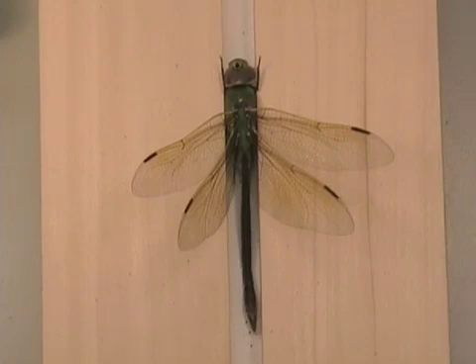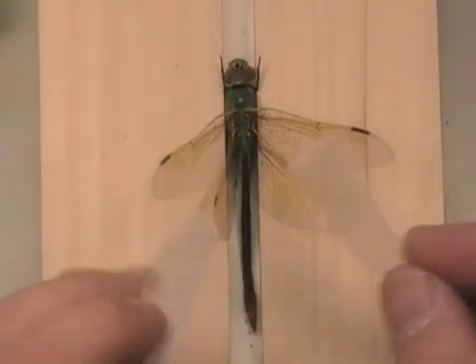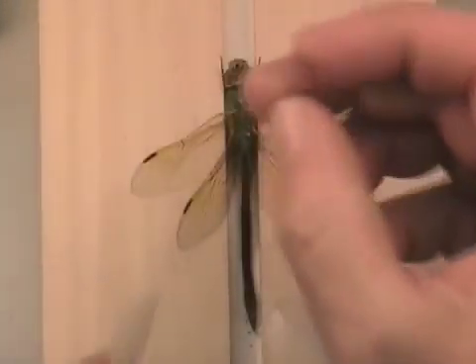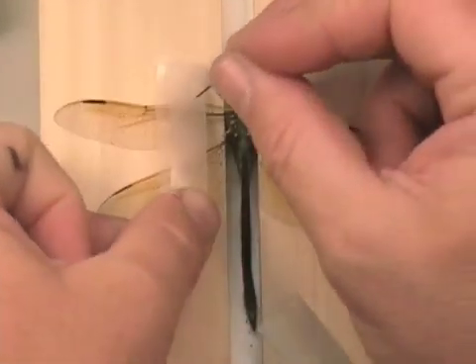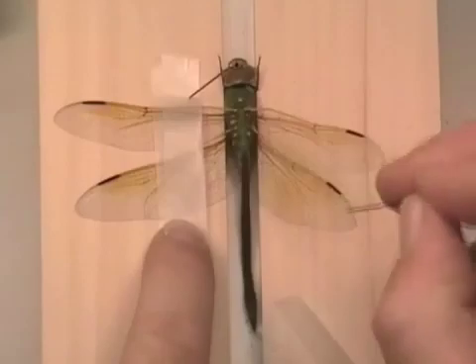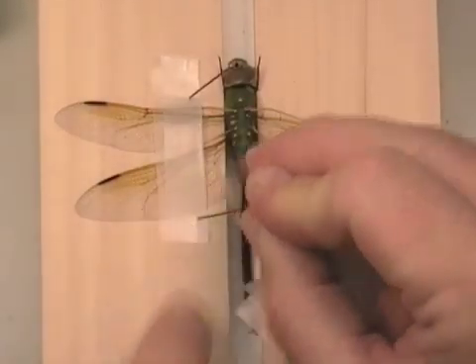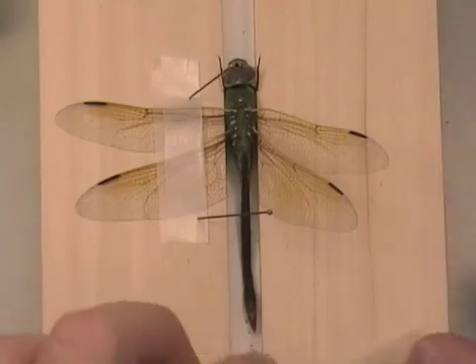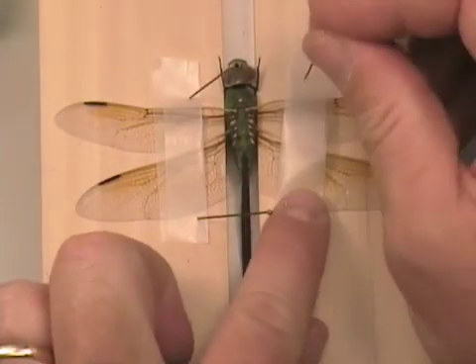We will use pieces of wax paper for each of the wings to hold them in position. This time, instead of the trailing edge of the front wing being perpendicular to the axis of the body, we will actually make the leading edge of the hind wing perpendicular to the axis of the body.